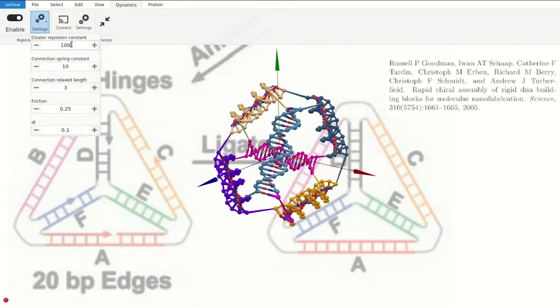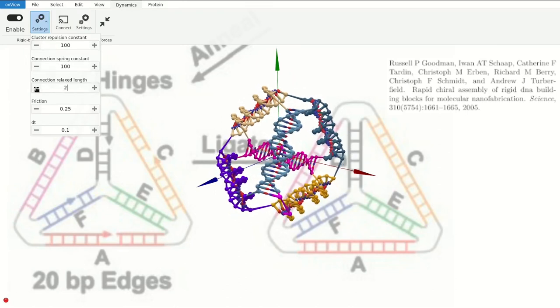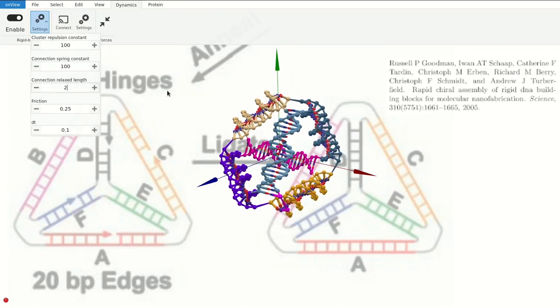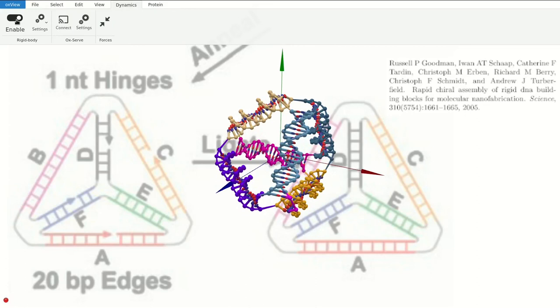Let's change some constants. The repulsion can be a bit lower, and the spring constant can be a bit higher, and that moves the things a little bit more together. Let's set the relax length to a bit shorter, and then you have your nicely treated structure. We can turn off the dynamics.